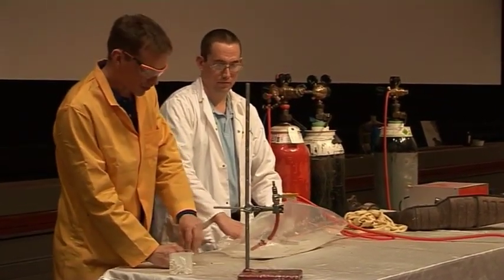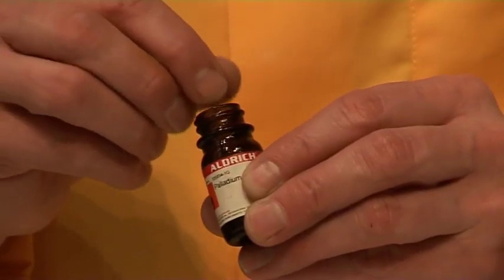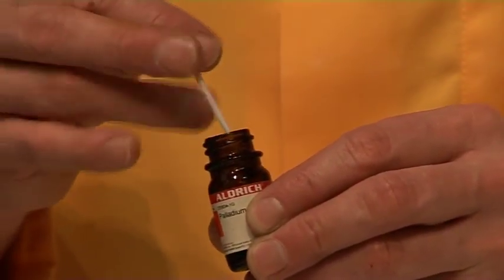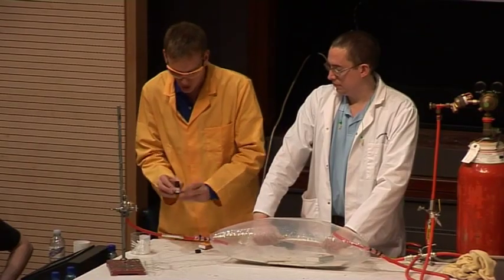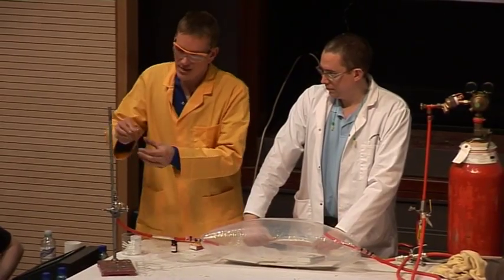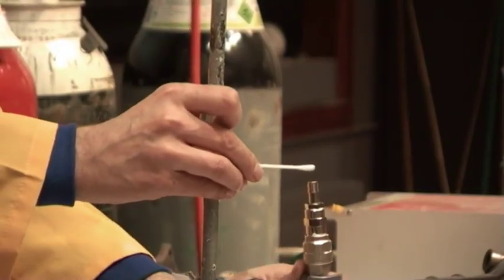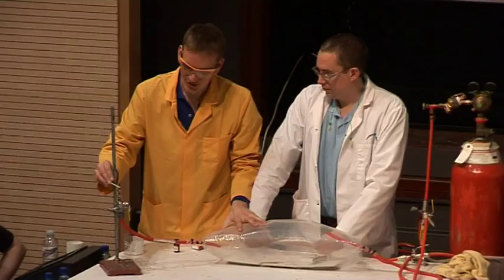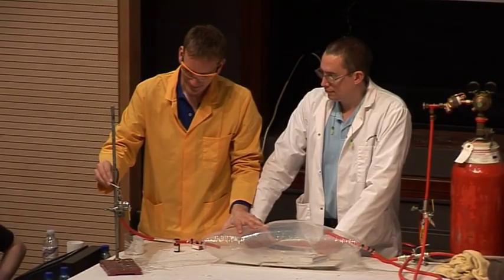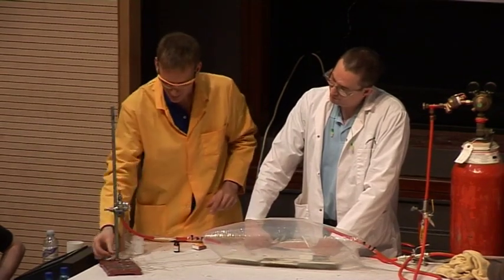Well, this time, what I'm going to do is see if we can light it a slightly different way. And I have some metal catalyst here. This is palladium metal, very finely divided palladium metal. I'm going to put a little bit onto this cotton bud and hold this in the jet of hydrogen. So there are no flames, but I'm hoping that the hydrogen will actually light. Well, let's see what happens. Nothing. But keep watching. Squeeze harder, Mark. There we are. It did indeed catch light.